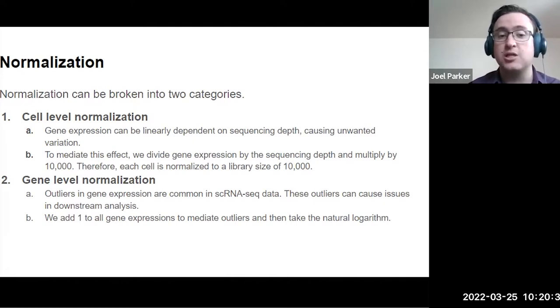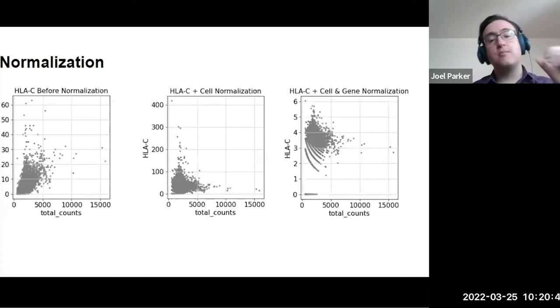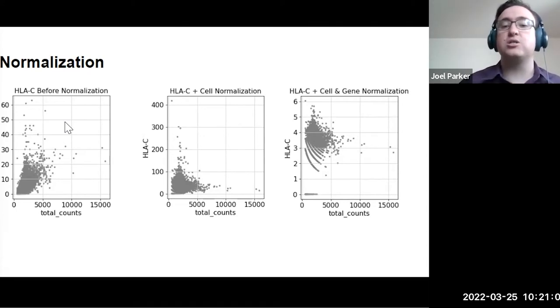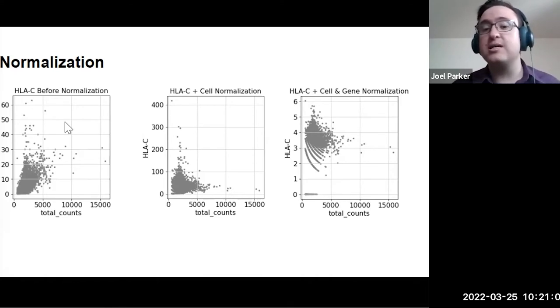Cell level normalization is important because gene expression can be linearly dependent on sequencing depth. A widely accepted method for cell normalization is to divide gene expression by the total number of counts in the cell and then multiply that by 10,000. Gene normalization is also essential for reducing the bias. Unfortunately, outliers in single cell RNA sequencing are common and failure to address this can lead to more noisy data. In the Shunpiker app, we take the natural log of all the counts to reduce the effect of outliers. However, since our data consists of many zeros, we add one to all of these counts prior to taking the natural logarithm.